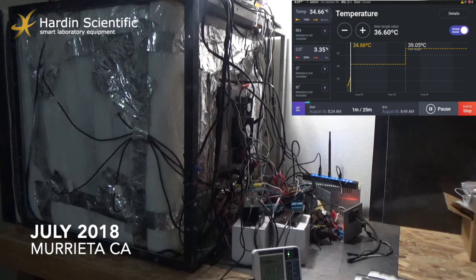So we have 34.66 Celsius degrees inside the chamber at this moment. Temperature is still increasing. You can hear some clicks from the CO2 module, because the CO2 module is trying to add some portions of gas, and these portions are shorter when we are close to the target and longer when we are far away from the target.